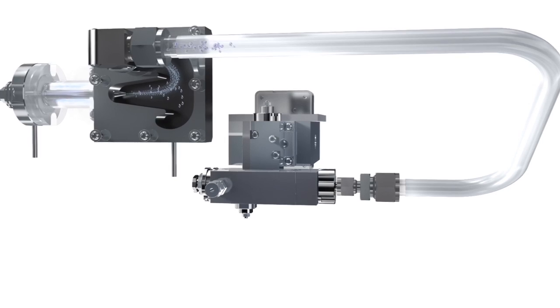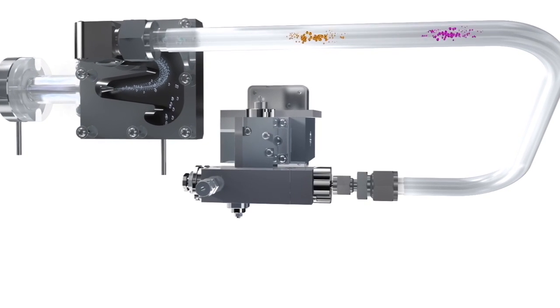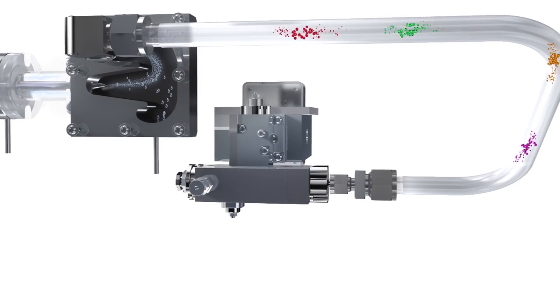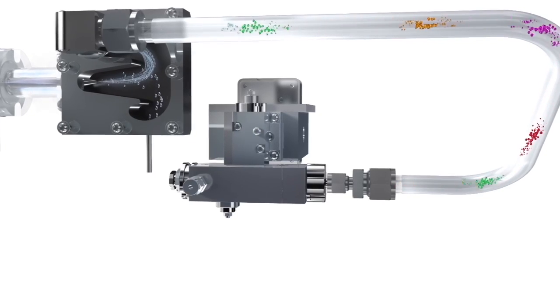The charged aerosol detector operates by nebulizing the eluent stream into ultrafine droplets. The solvent is then evaporated to form dried particles.